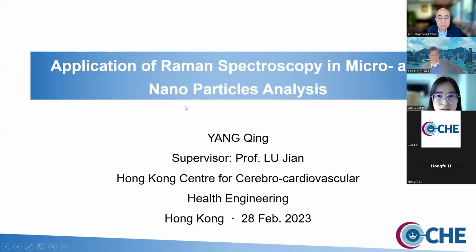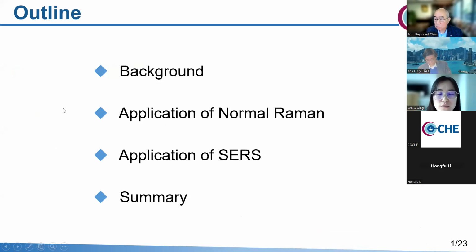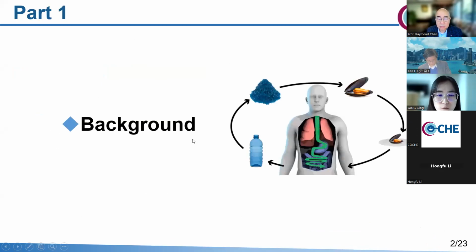Hello, everyone. The topic I want to introduce is the application of Raman spectroscopy in micro and nanoparticle analysis. And I will introduce it in these 4 parts. The first part is the background.